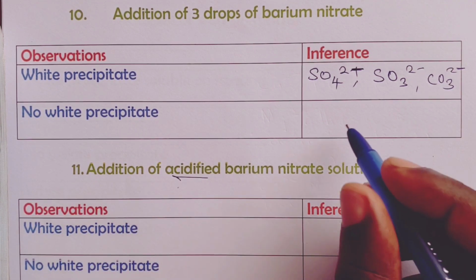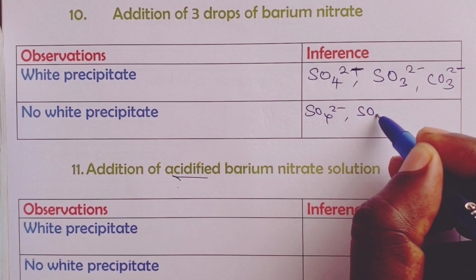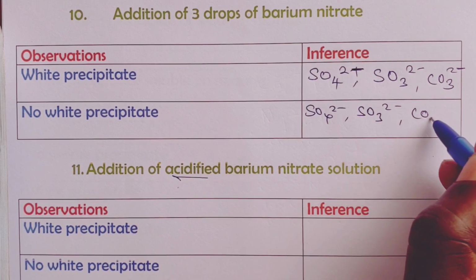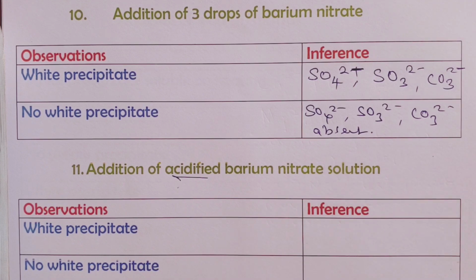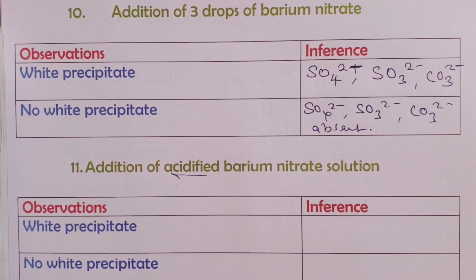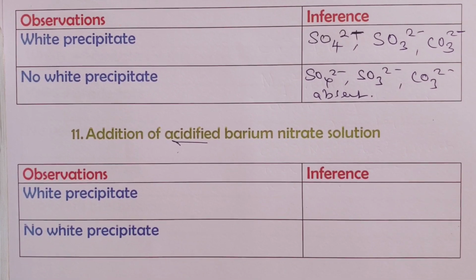And when you don't see that, then the same sulfate, sulfite, carbonate, this time round, we would infer that these are absent.